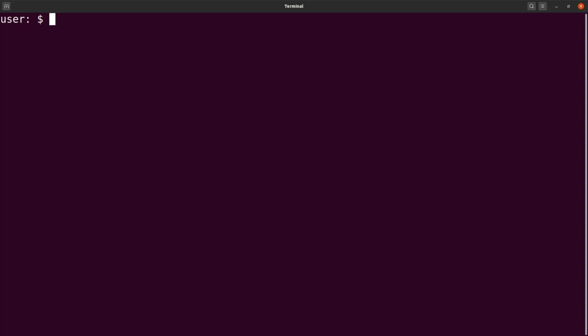On the terminal, the first thing I will do is to create a working directory. So I will say mkdir vcfs. I will then cd to it. The reason why I do this is to separate files that I'll be generating for this exercise from other files on my PC. Doing this helps you to organize your files and prevent accidental removal or modification of files. That is why I create directories for every project that I do.